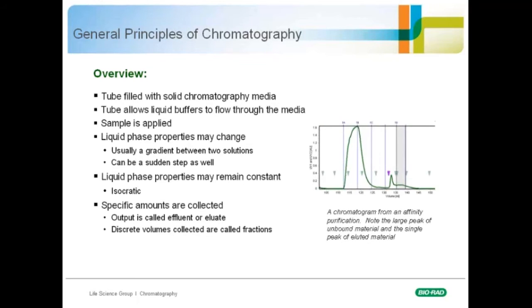And what you see here on the right is a chromatogram. This is essentially an output of what you're doing in this whole protein purification process. Notice on the right, you see a very small peak. This is actually our protein of interest. This is not uncommon for a first step, that you see a lot of components in a mixture that actually aren't the ones we're most interested in. I'll go into greater depth about this in just a moment, but this gives you an idea of what a typical protein purification procedure might look like.